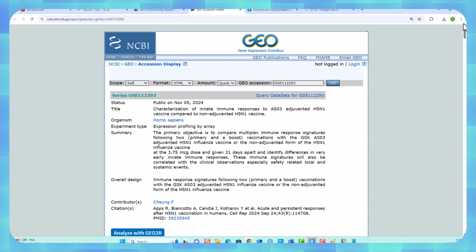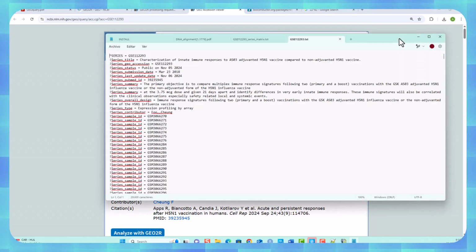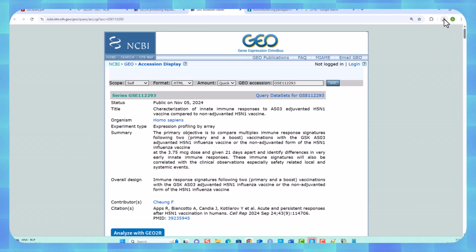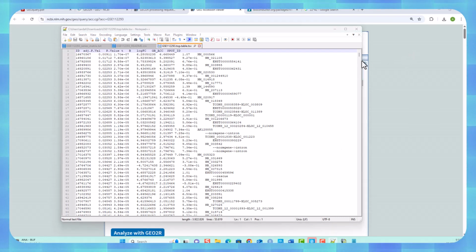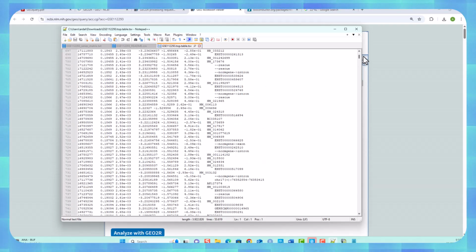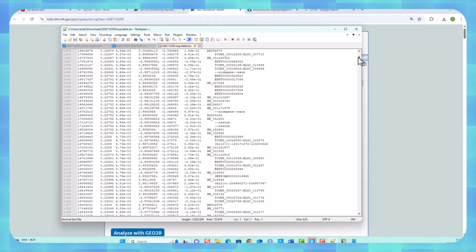It has finished my download. It's finished the top table. So here is the table that I wanted. Remember, it's done all 53,000, when I said I only needed the top ones that went down to being a significant p-value. So the p-values are significant down to 0.05.